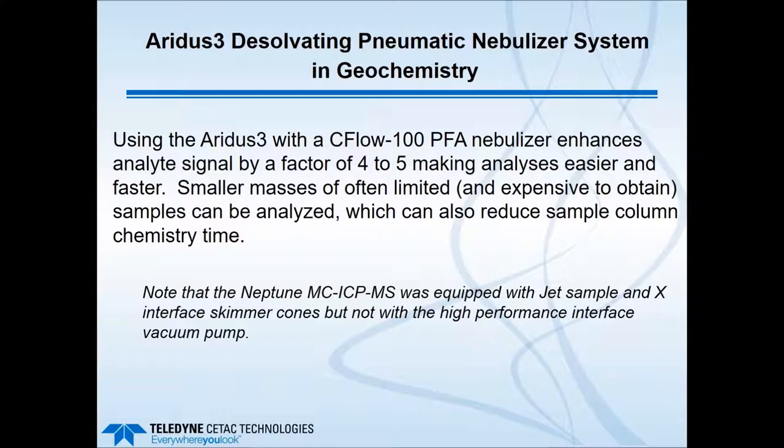It also reduces sample column chemistry time. Of course, you have to have more chemistry and more column time if you have to use larger masses of sample in order to simply get enough analyte to detect.